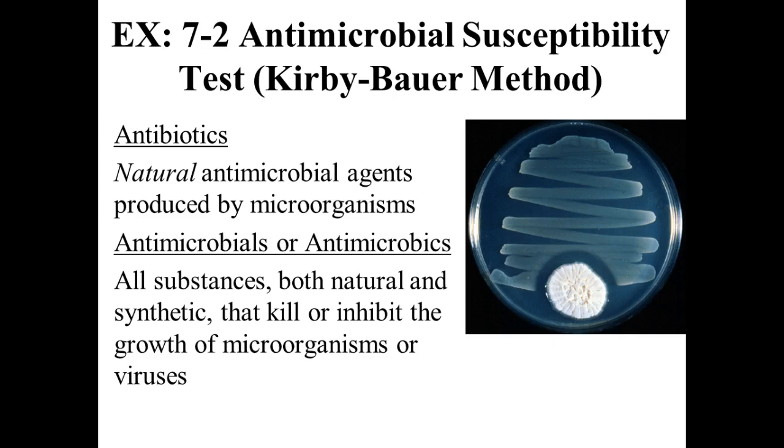No, it's killing the bacteria. Penicillin will kill the bacteria, right? It will kill the bacteria. And that's why you see here, near the penicillium, where the penicillin is, this Staph aureus, this gram-positive bacteria, is actually killed. There's no growth here. Just like we saw those zones of inhibition, those no-growth zones on our plates because of the antibiotics, it killed that bacteria.